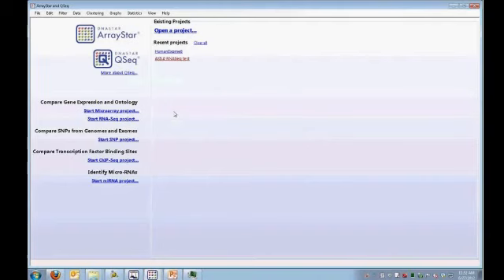It also grew to bring in databases, ontology information, feature information in database format. So it's well designed to bring in massive amounts of data in table form. Well, that's exactly what SNP reports are, variant reports, that we generate in SeqMan.